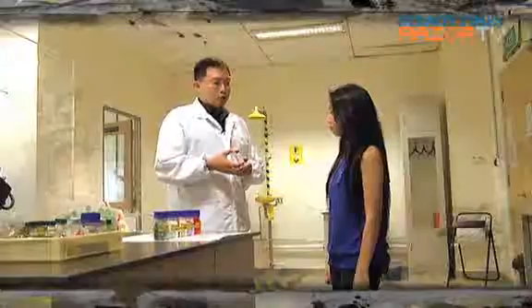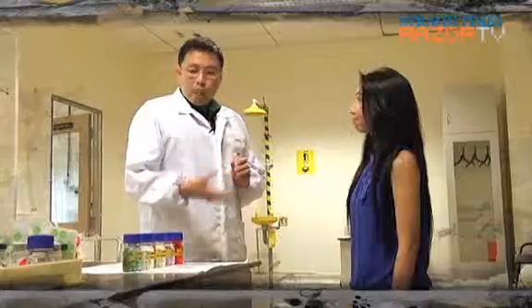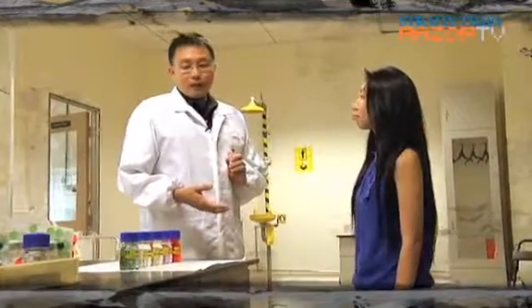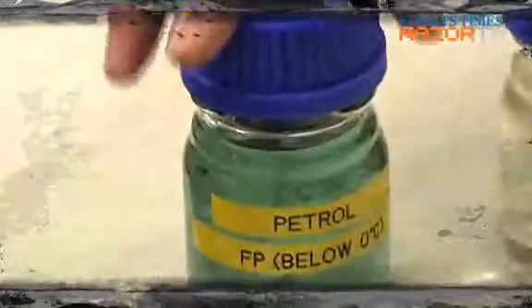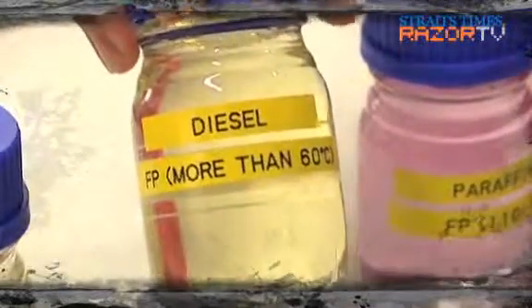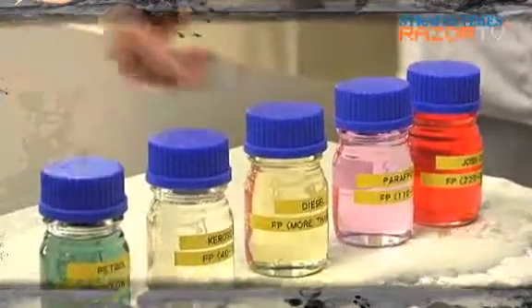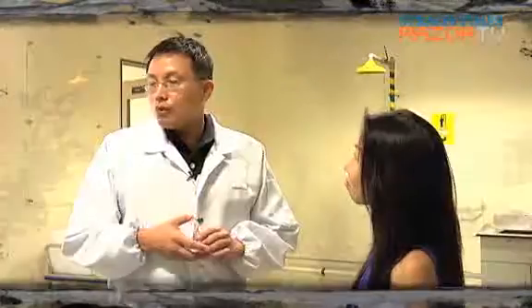Another test we do is to determine the flash point of the unknown mixture. Flash point of the mixture is the lowest temperature at which the mixture gives off ignitable vapor in the air. The lower the flash point, the more flammable the mixture is. For example, let's say petrol. Petrol has a flash point of less than 0 degrees compared to diesel, which is about more than 60 degrees. So petrol is more flammable than diesel. Let me show you how we do the flash point testing of the mixture.